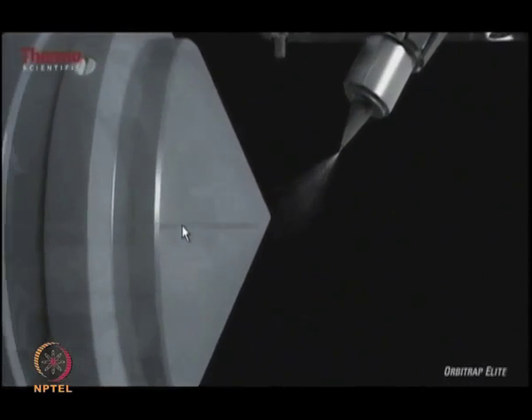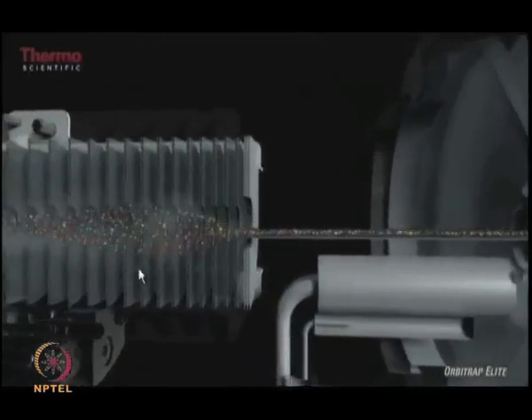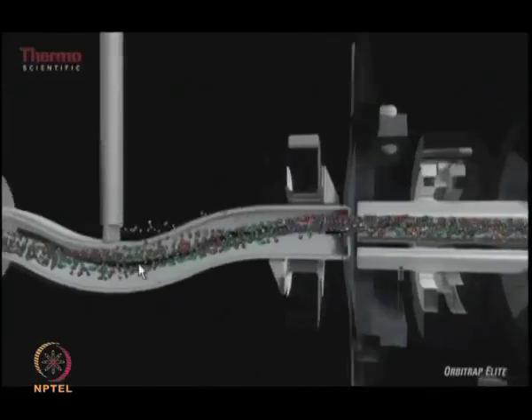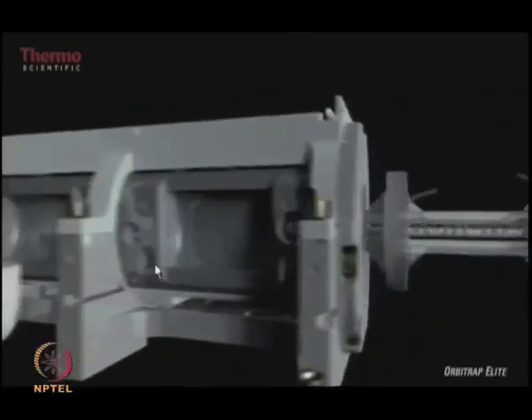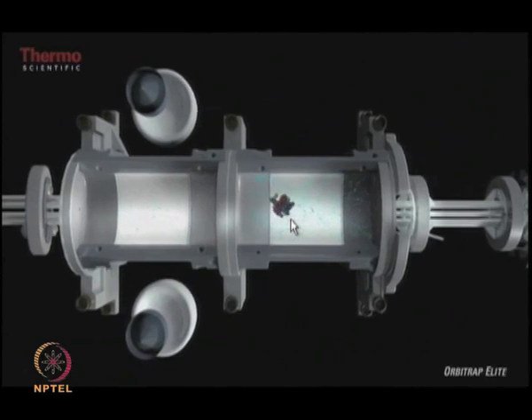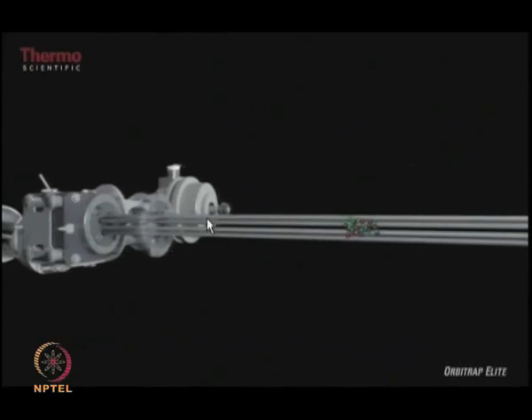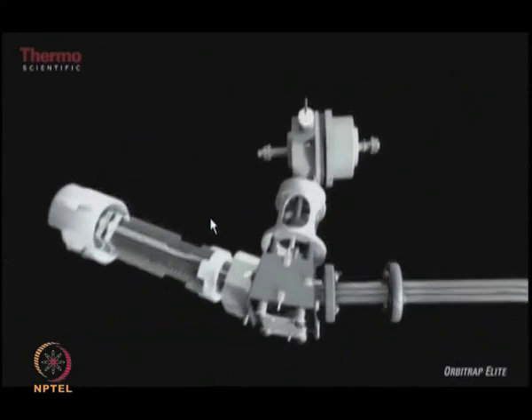So coming back to the ionization source, the ions generated from the source go into the transfer optics. After going out from the transfer optics, they go to the linear trap. In the linear trap, in a full scan mode, the ions are stored in the high pressure cell. Once stored, the ions are then transferred through the ion transfer optics into the C-trap.